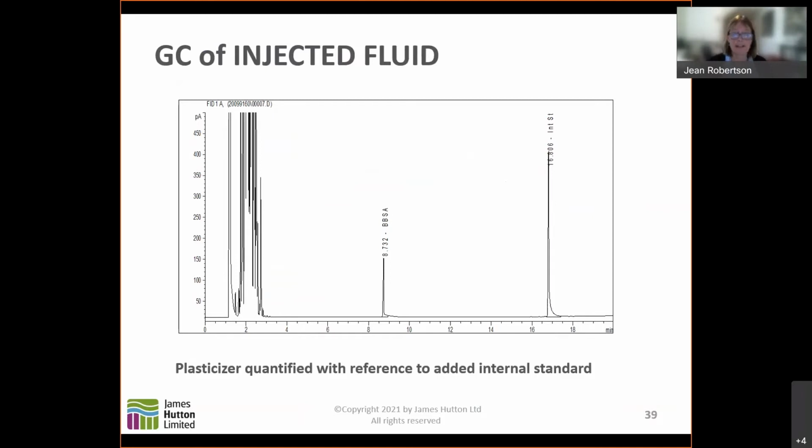So then, as I say, we have a full picture that we can put back to the customer, and they will be able to know whether the plasticizer which is being leached is being leached to such an extent that there's going to be a problem.